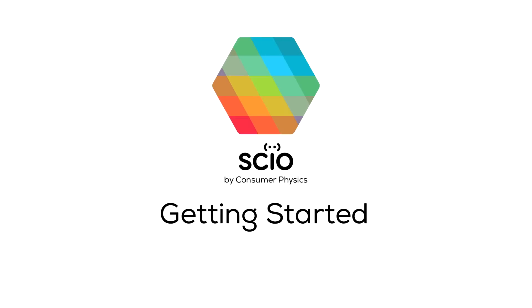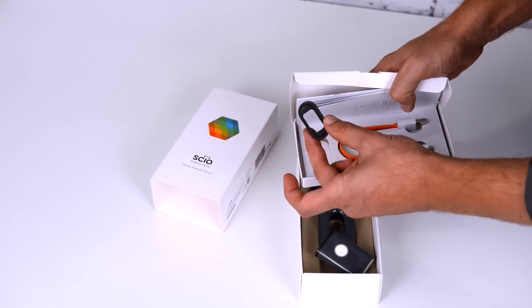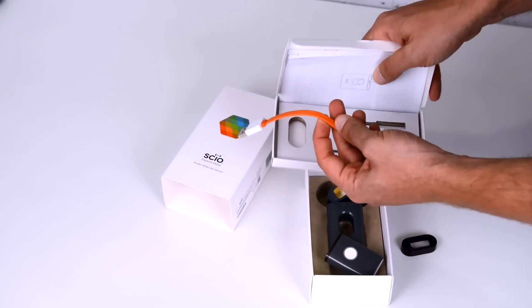Hi, Hagai from Consumer Physics here to get you started with your new Sayo. So in the box you got your Sayo, the Sayo cover, the optical shade, the small object holder, and the charging cable.